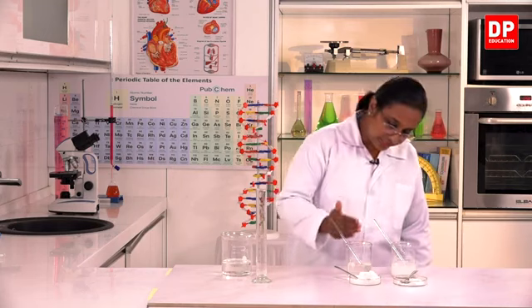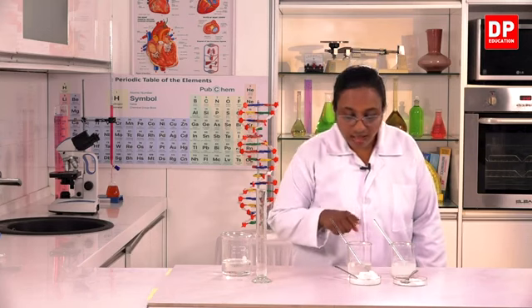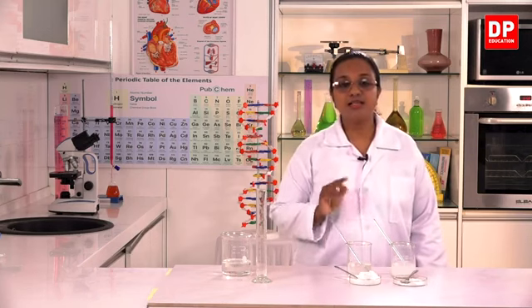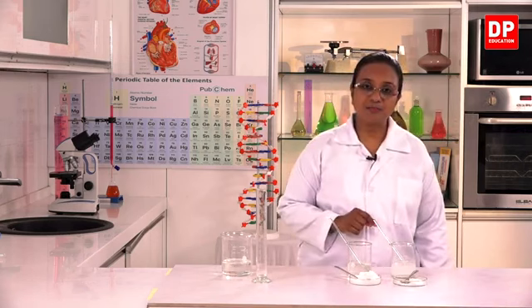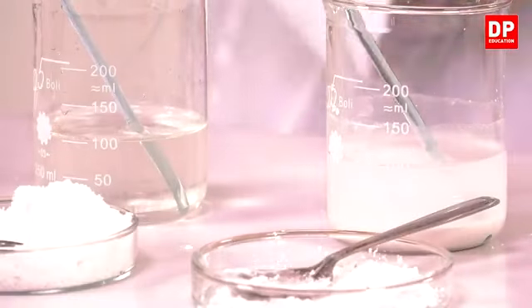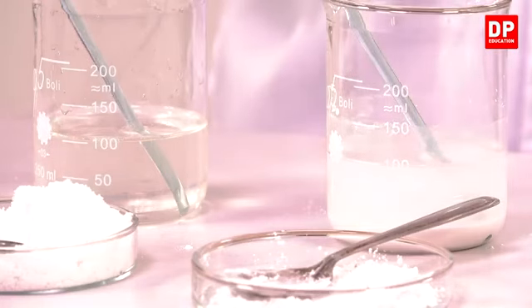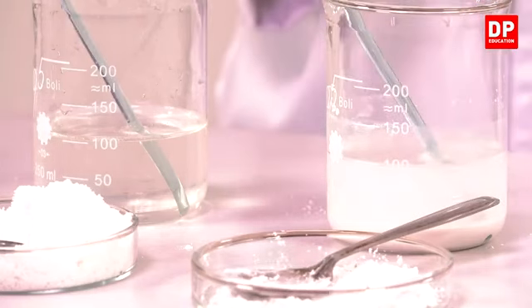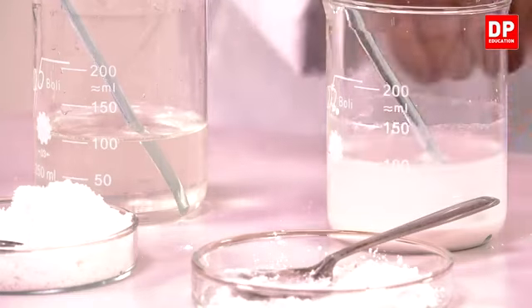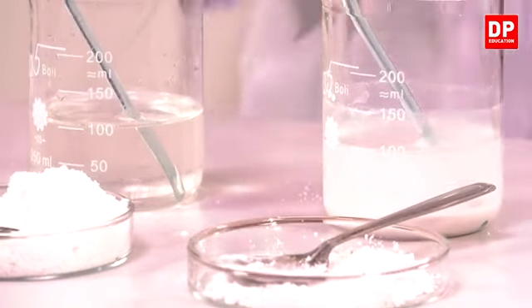you can see still the sodium chloride solution is clear and transparent, and all the sodium chloride solid has dissolved in water. But if you look at this calcium hydroxide, you can see that the solution is changing. At the top, the solution is becoming more clear, and at the bottom, although initially it looked as if calcium hydroxide dissolved in water, now you can see the solid depositing at the bottom. So from this, what can we infer?